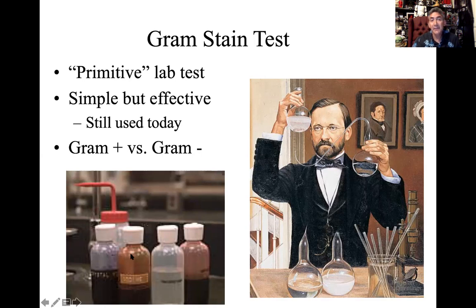The iodine is going to be important because if we're working with bacteria, maybe it is pathogenic, we don't want to be working with active or live bacteria. So the iodine would be useful in the killing. We're going to heat fix it. We're going to use heat as well, but if they survive the heating process, then the iodine will be important in killing them. And then also alcohol. Whatever the iodine doesn't kill, the alcohol will kill, and the alcohol also is good at extracting fluids from these bacteria and extracting excess stain from the first process.